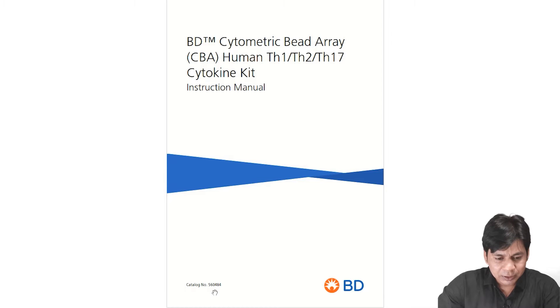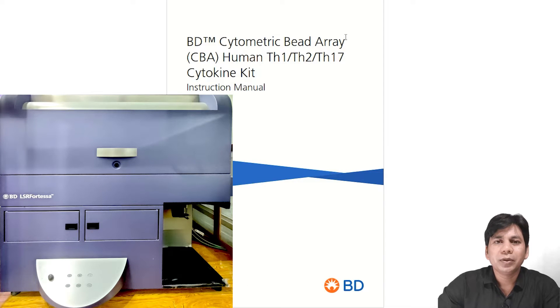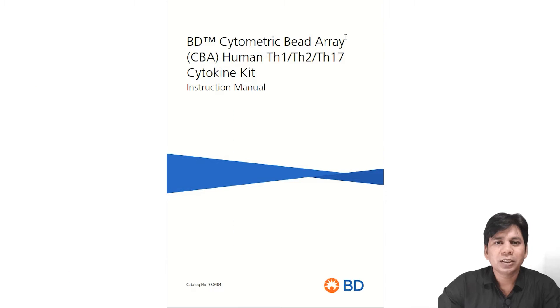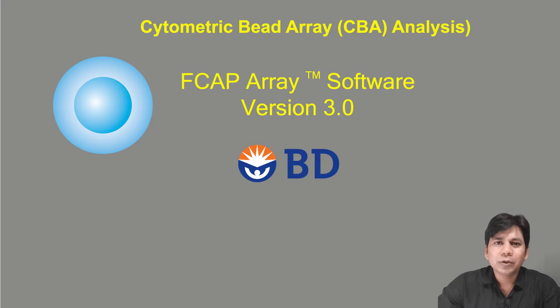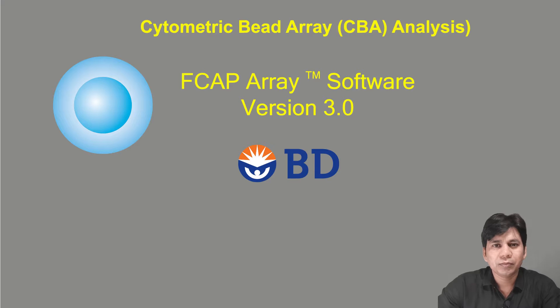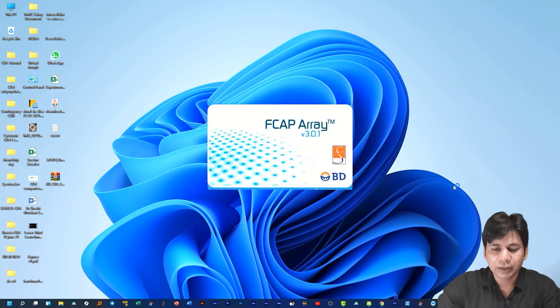The kit catalog number is 560484. We ran our samples in the BD LSR Fortessa machine and exported our data in FCS version 3. Today I am going to show you how you can analyze your CBA data using the FCAP Array software. You can see on my laptop screen.